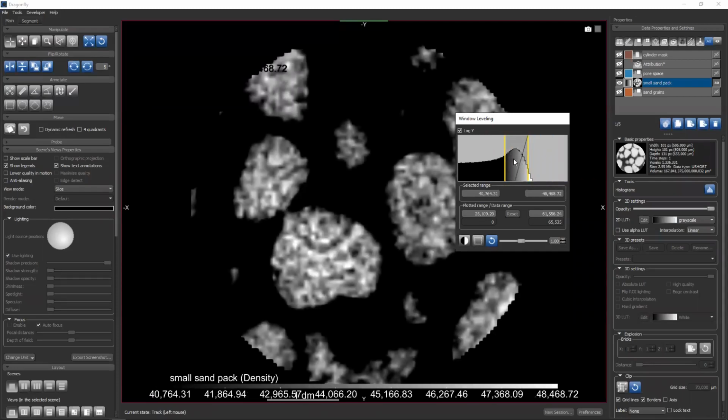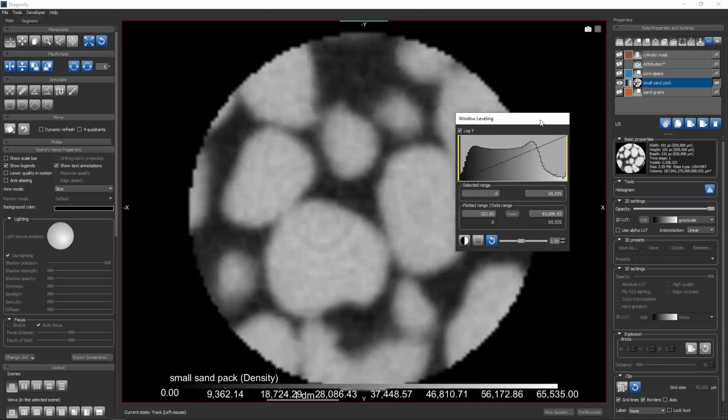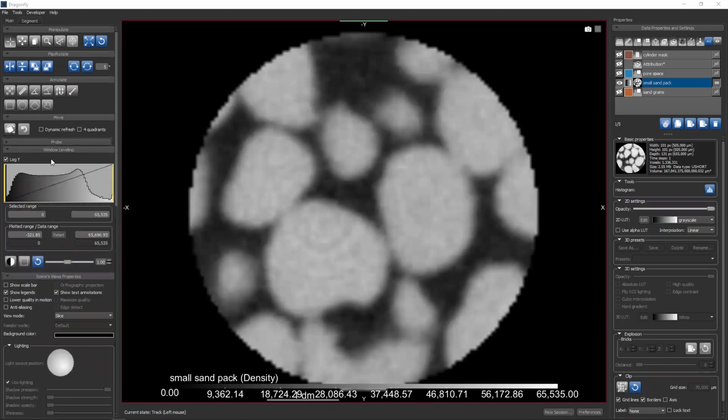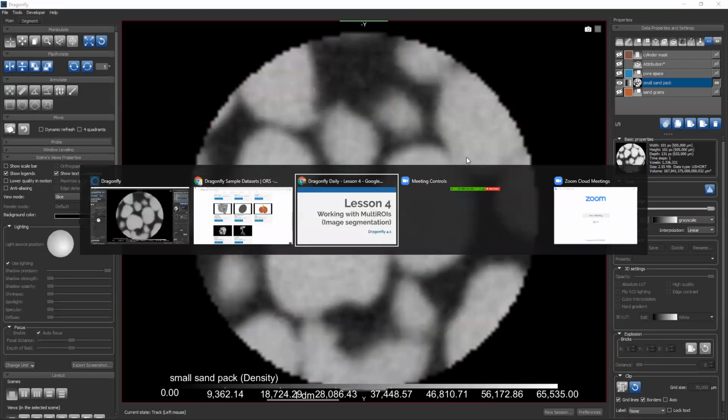So we'll try and revisit it in a webinar after we've launched 2020.1. So enough of that. We've got content to talk about with respect to ROIs and multi-ROIs. I'm going to double click to dock that back in place. Now, I have right here an ROI called sand grains, but I did promise that I would show you how to create that ROI on your own. I haven't even told you what an ROI is or what the topics for today are.